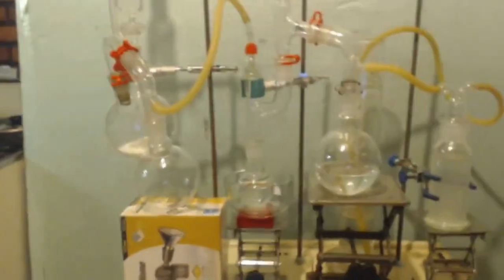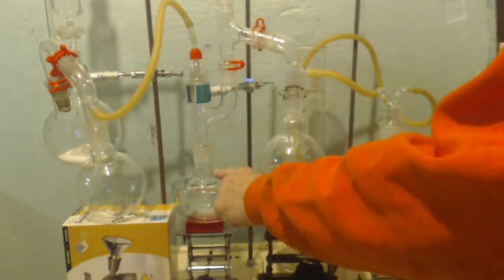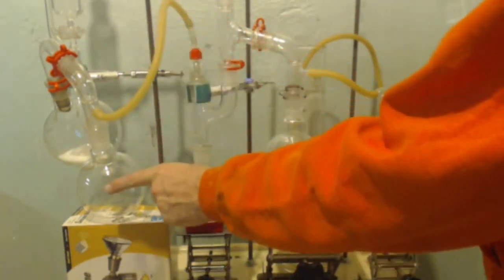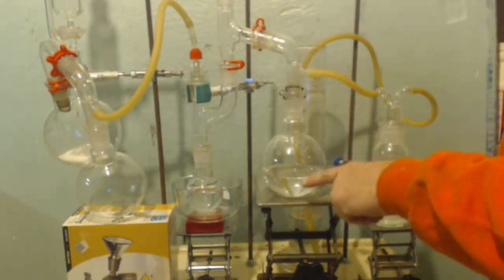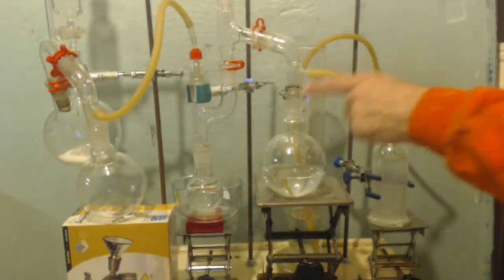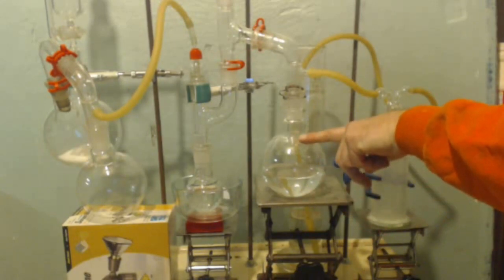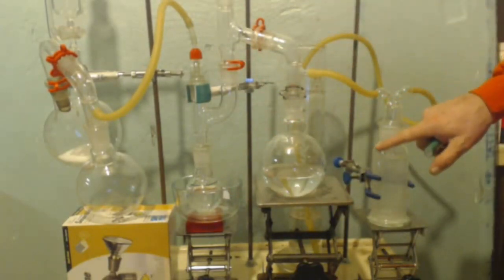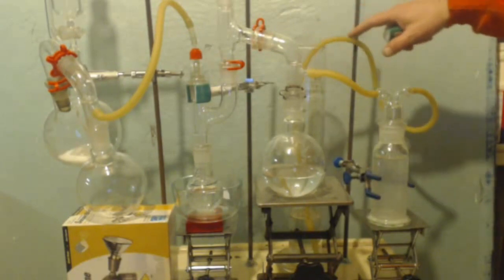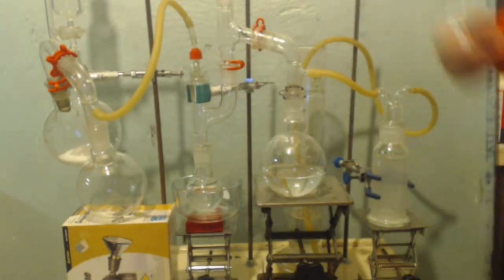So what's going to happen here, right? If a suckback happens, this will get sucked up through the tube to here, not to the pot, right? This cannot get sucked up because there's no tube going down to it. This will get sucked up into here and fill it all the way up, because there's 250 milliliters here, there's about 200 there, it should be up here, you know what I mean? But it can't get sucked back up into there. And then this will be sucked into here from this graduated cylinder, and it only has 250 milliliters in it. I figure I can add more later on if I want, if it's smelling up the place or whatever. This is the gist of it.